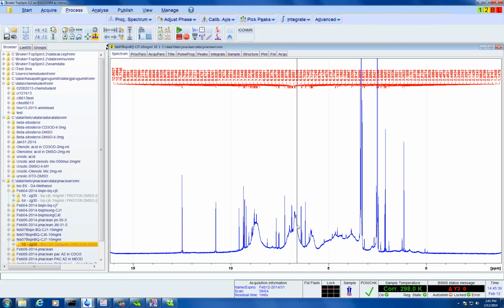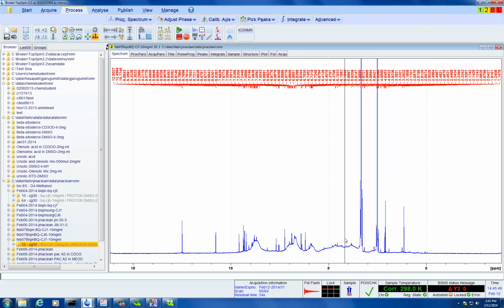This is derived from cranberry juice, so you see what some of the problems are going to be in analyzing juice. Previous samples that Sarah had run were either leaf extracts or fruit extracts. From juice, it appears to be even more complex because you've got sugars in there, and we don't know if the sugars are actually attached to the polyphenols or separate molecules in addition to the polyphenols. The spectrum is pretty complex. So the juice is just straight up in this liquid form.